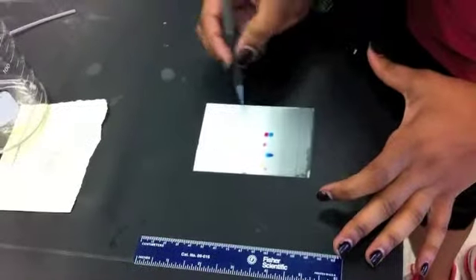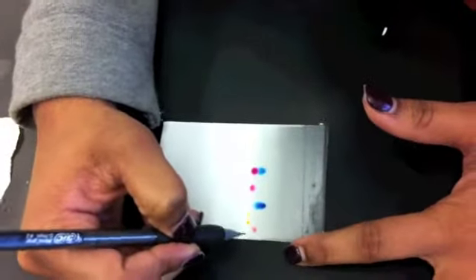Here's the one that the solvent went to the top of. I think it was left here a little too long, so try not to do that next time.